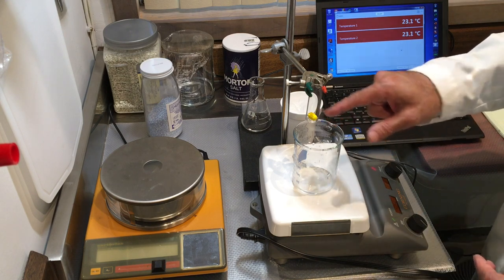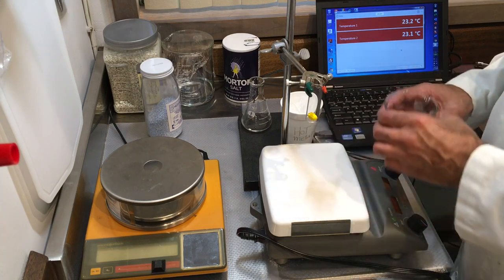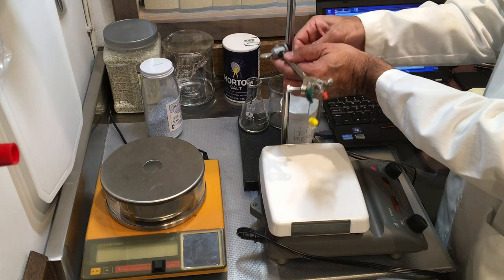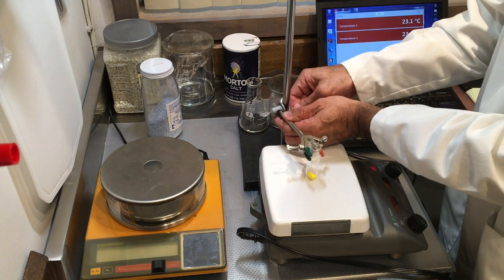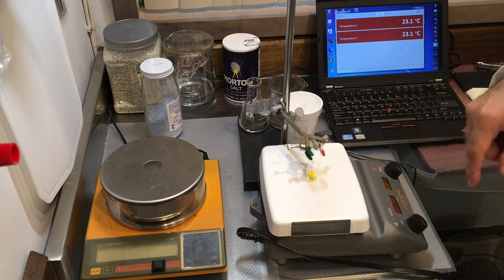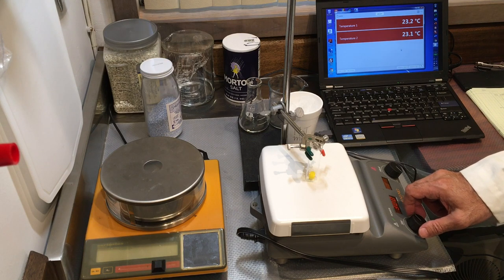I have a little stir bar inside of this test tube. The function of this stir bar is to mix the solution. My solution will be inside that test tube, and while it's freezing it will be mixing — spinning at a relatively high speed, perfectly mixed while it freezes.